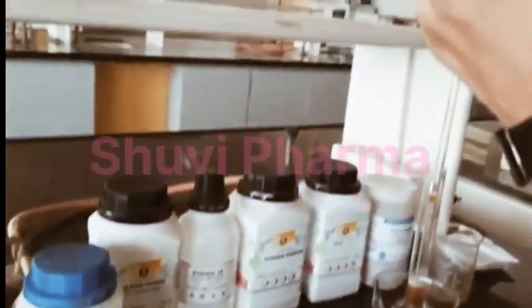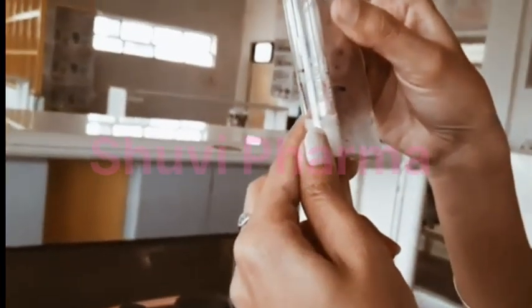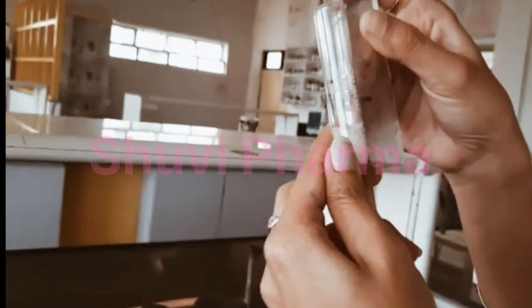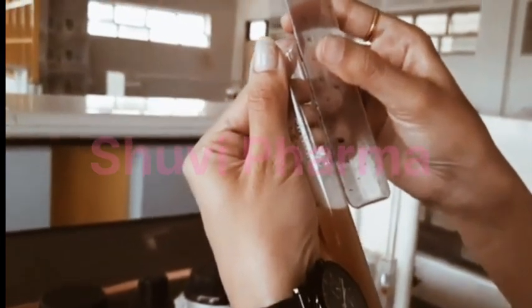So for the first test tube, height of the foam is 0.9. For the second test tube, height of the foam is 1.7. Third, it is 2.